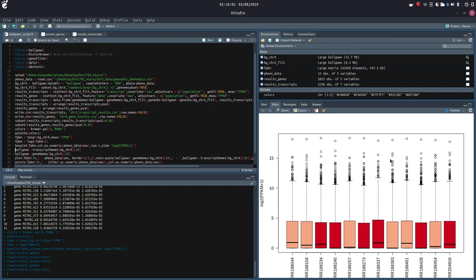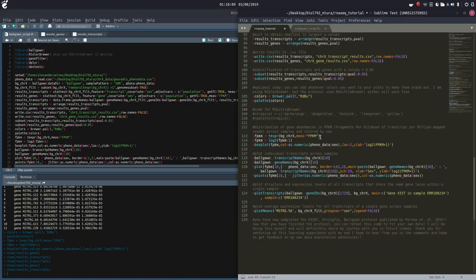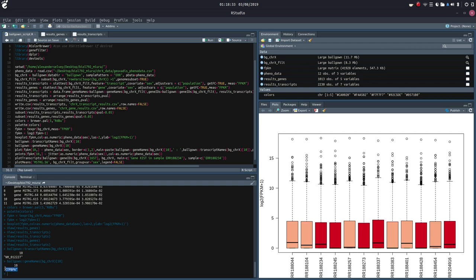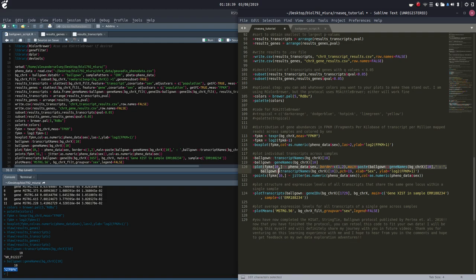We're going to enter this command — it's just going to return the transcript name and this command is going to return the gene name and print to screen. Transcript name: 10, NM_012227. Gene name: GTPBP6. Now we're going to plot these things — we're going to plot the FPKM of our GTPBP6. Using our phenodata we're going to extract the sex. These are our borders. Main is paste ballgown gene name, so this is our main title — and we're going to use GTPBP6, x-axis, y-axis.